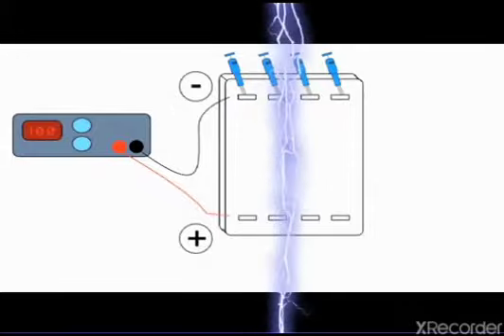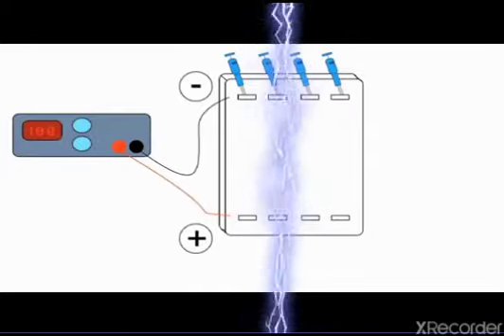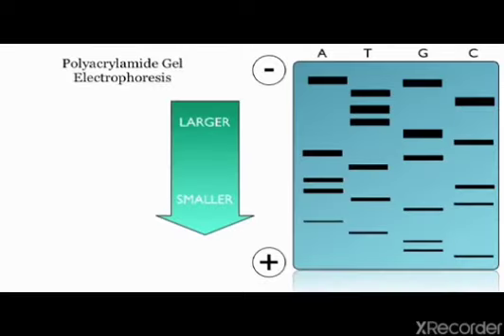A current is set up across the gel and the DNA is inserted at the end with the negative electrode. As the DNA is negatively charged, it will begin to migrate towards the positive electrode. Smaller fragments will move faster than larger fragments. The gel is dried down and an X-ray taken.